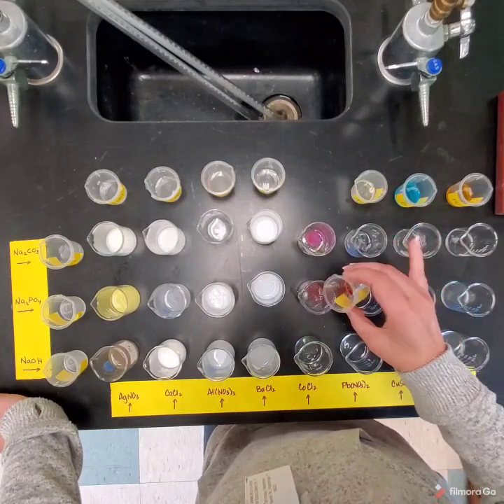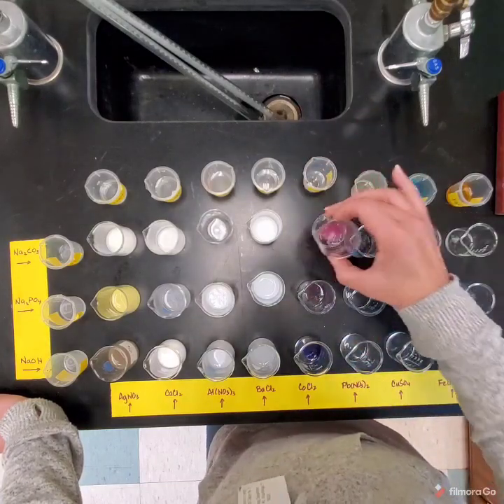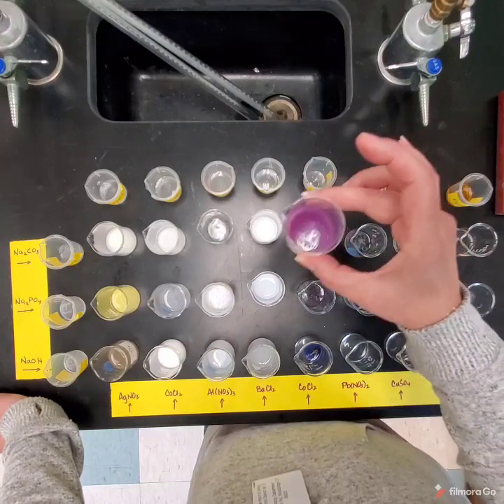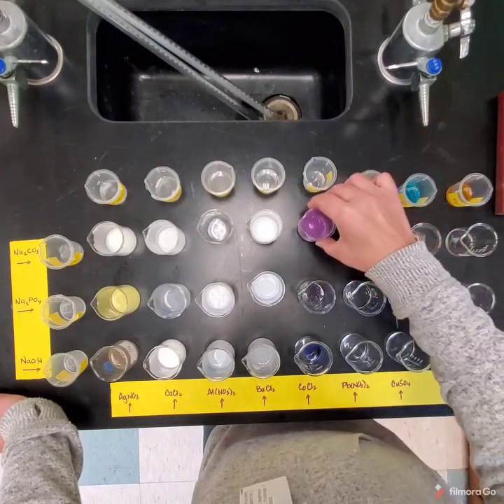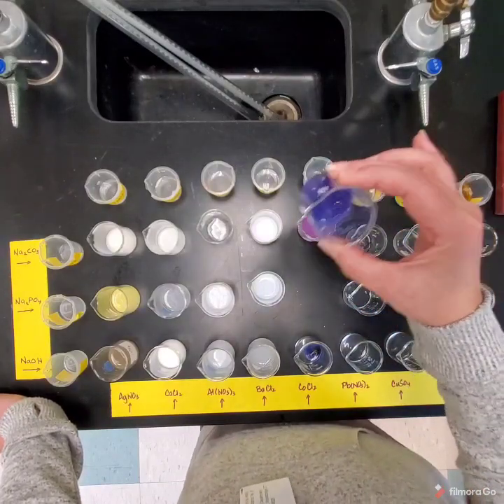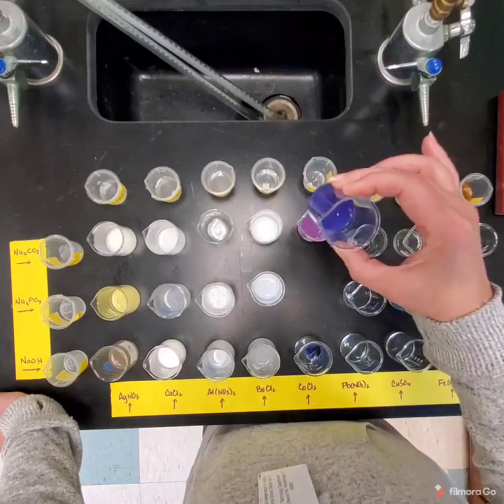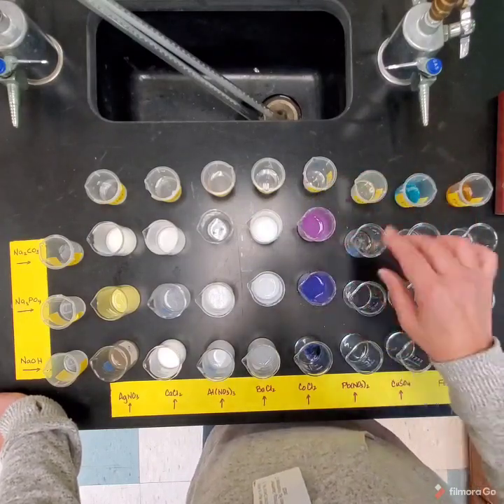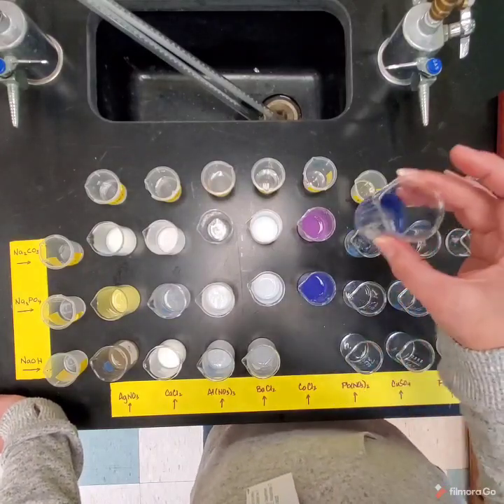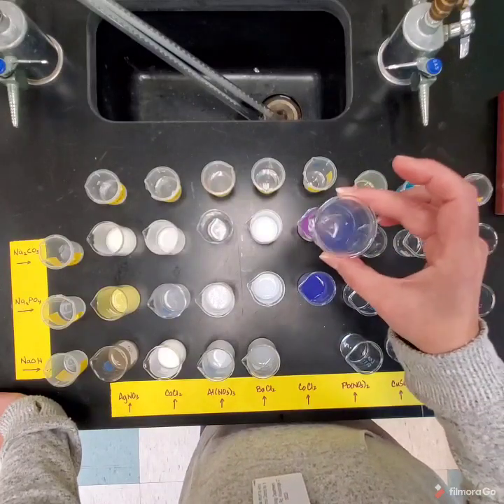We're getting some colors other than white now, which is kind of nice. Okay, so here we go. Now when we get to elements that are in the transition metals, look at that one. Nice pretty color, purple. And it's a little goopy, a little gel-like. You get pretty colors when you deal with elements that are in the transition, though barium, oh, this is cobalt. I was thinking barium. So here's another one, and this one is not really that goopy.